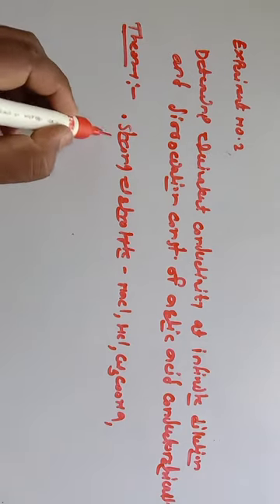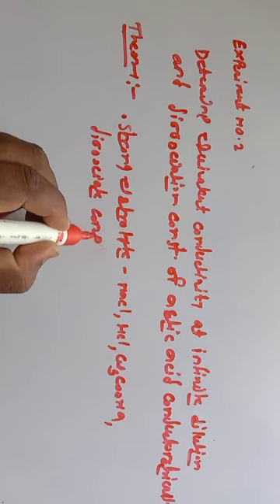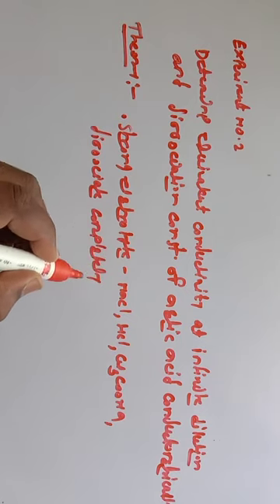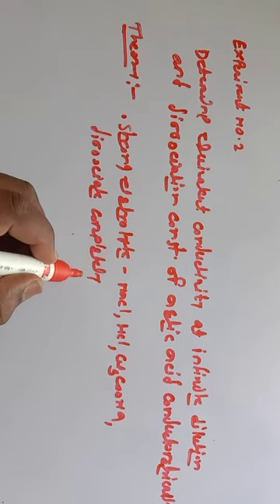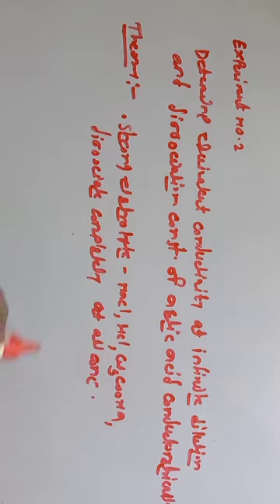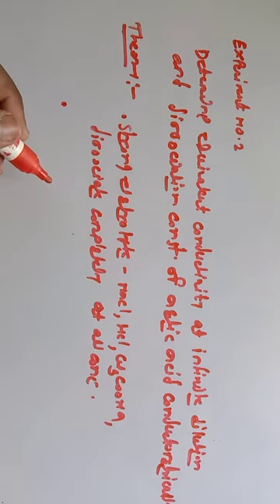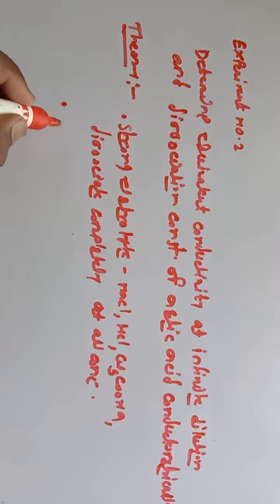They dissociate completely at all concentrations, and there is a linear increase in the equivalent conductivity. The second important point is that strong electrolytes such as NaCl, HCl, and sodium acetate dissociate completely at all concentrations, with a linear increase in the equivalent conductivity.